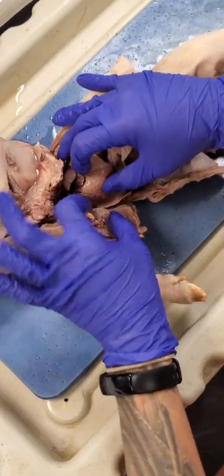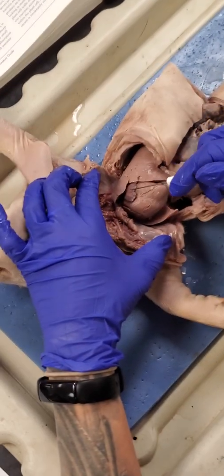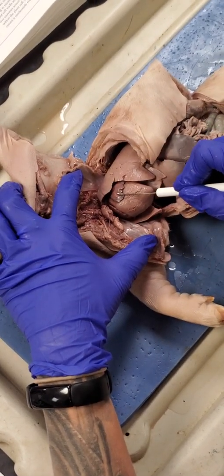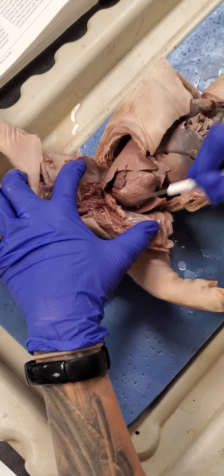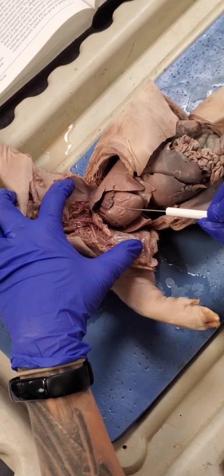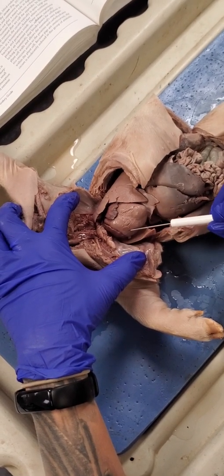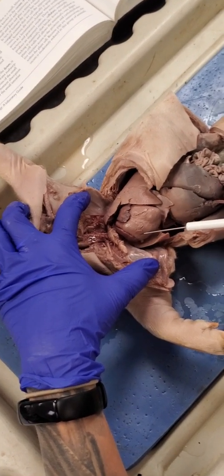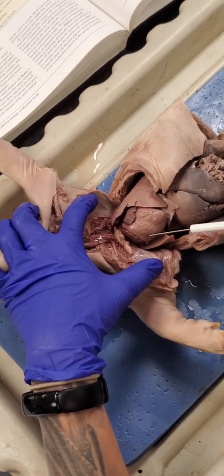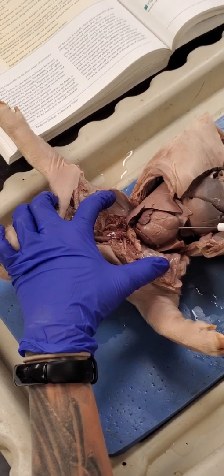So now we're going to look at our atrium, right? So again, you guys see these parts right here, boom, boom. So this is going to be the left atrium, this is going to be the right atrium, and this is going to be the ventricle. So see this septum right here? You can actually see the difference between the left ventricle and the right ventricle. So the pig's left and the pig's right. Left ventricle, right ventricle, separated by the septum.